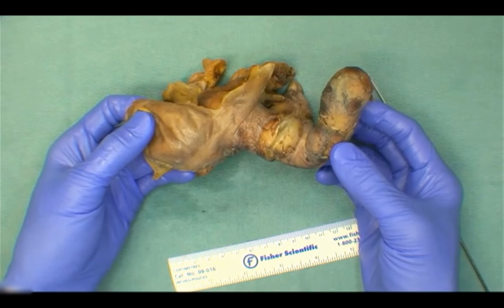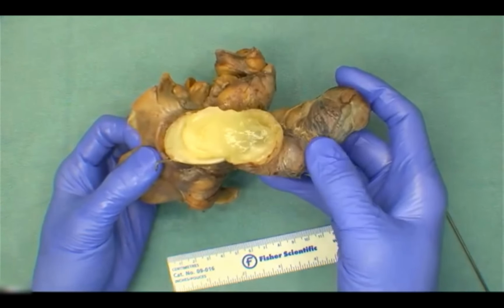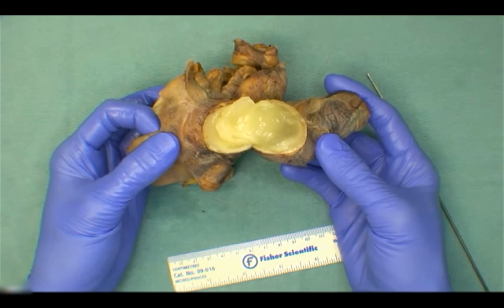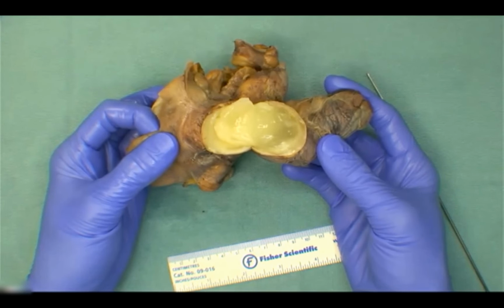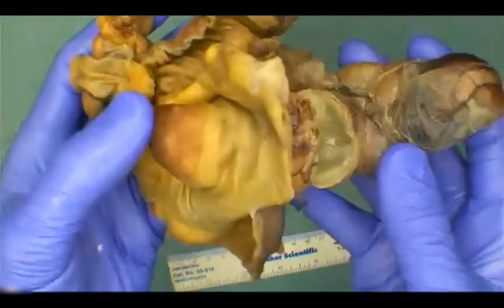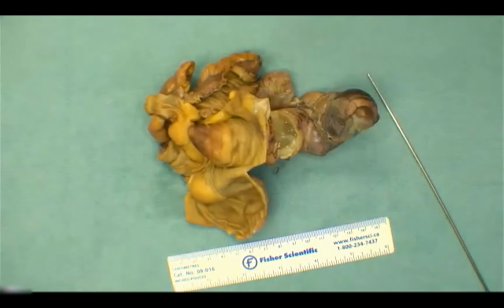Then take cross sections of the appendix, look further down the appendix to see what else is going on, and evaluate things like the wall thickness, what the contents are, are there other more solid areas, are there excrescences, are there other reasons and causes of what we're seeing to cause this obstruction. And then from there, talk about margins.